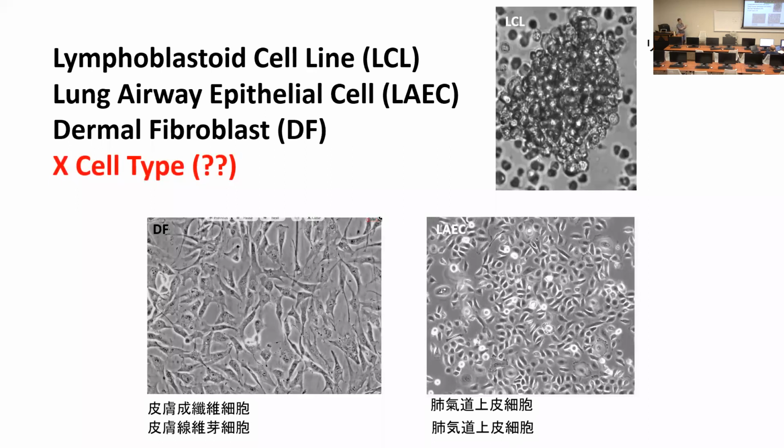Once we finish this, we will also have an X cell type. I'm not going to tell you what the cell type is, and when the time comes, you will guess what it is. So this is a mystery X cell type.